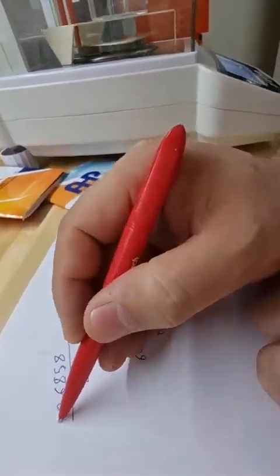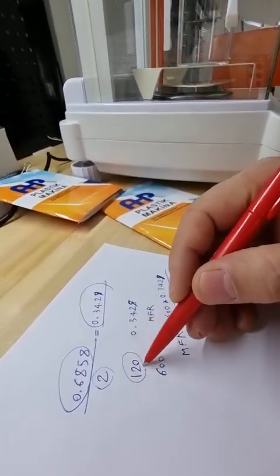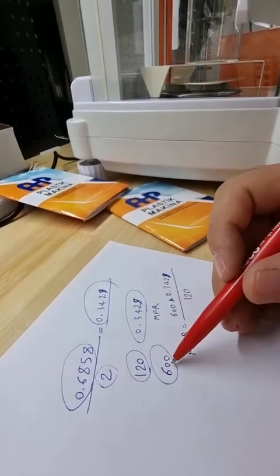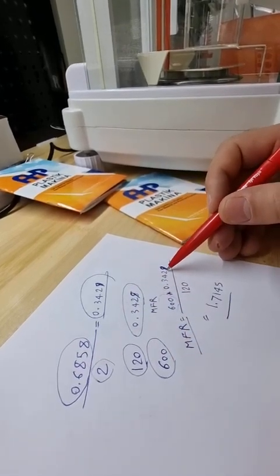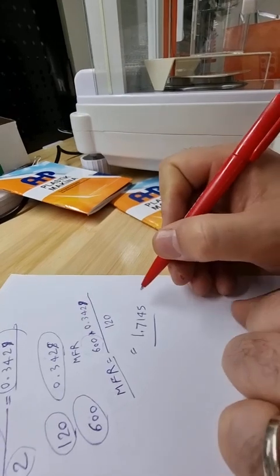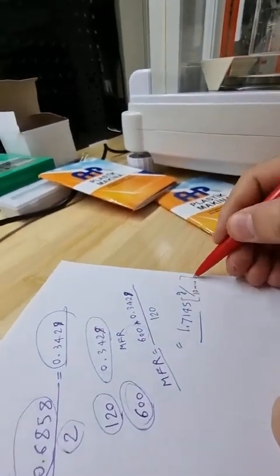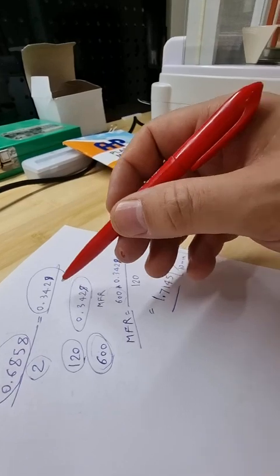The average mass for the two pieces was 0.3429 grams. For 600 seconds (10 minutes), the melt flow rate is calculated as 600 × 0.3429 ÷ 120, giving a value of approximately 1.7 grams per 10 minutes. The unit is grams per 10 minutes because we scale to 600 seconds.